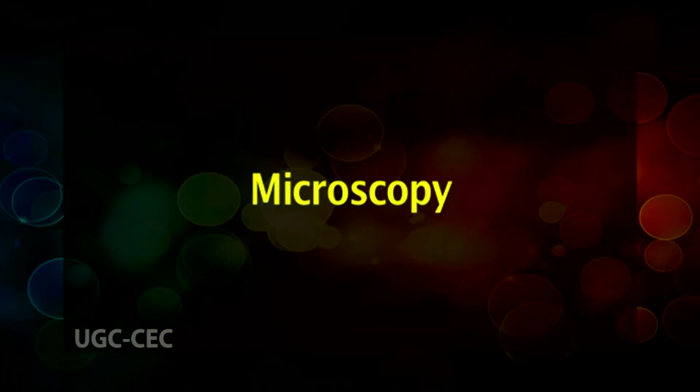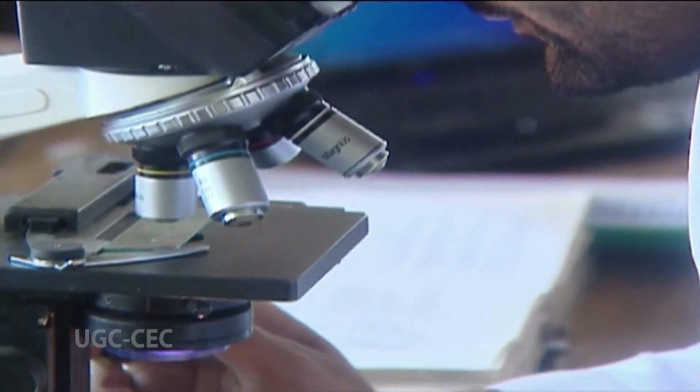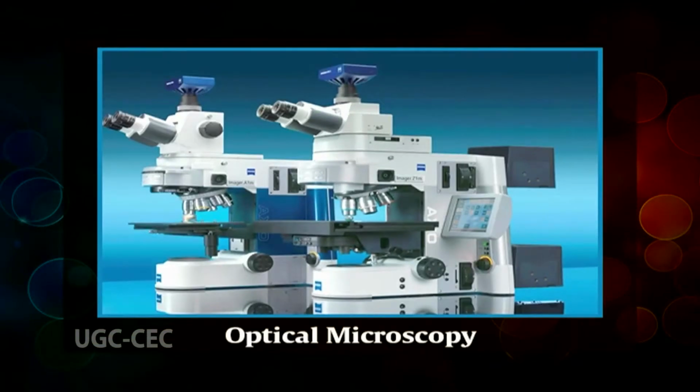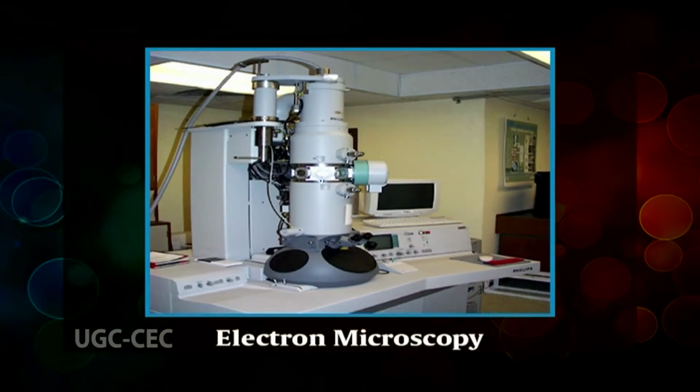Now coming to microscopy. Microscopy is the technique used to view objects that cannot be seen by the naked eye but can be seen with the help of microscopes. There are three main microscopic techniques that are used, which include optical microscopy, scanning probe microscopy, and electron microscopy.